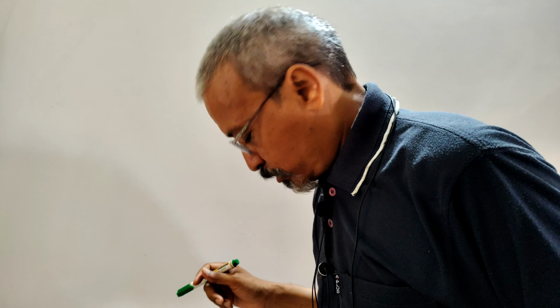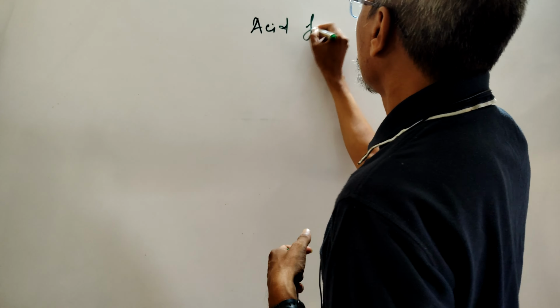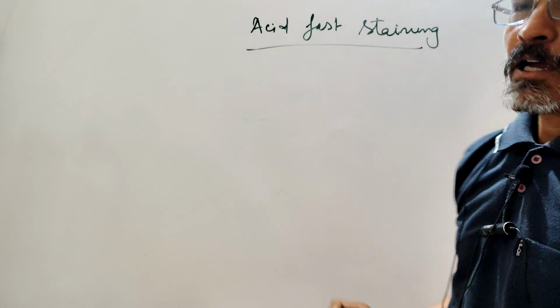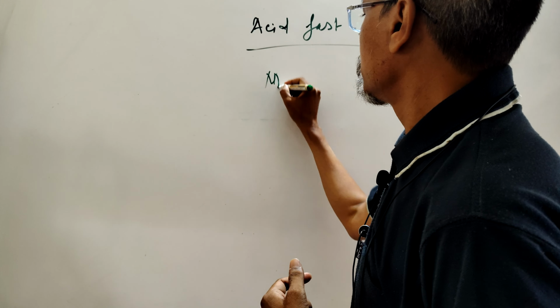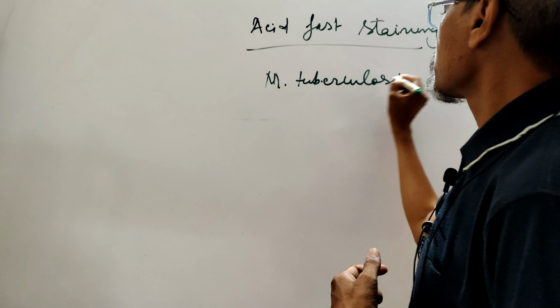Okay, so dear students, today we see the acid fast staining, and this staining is especially for the identification of Mycobacterium tuberculosis.